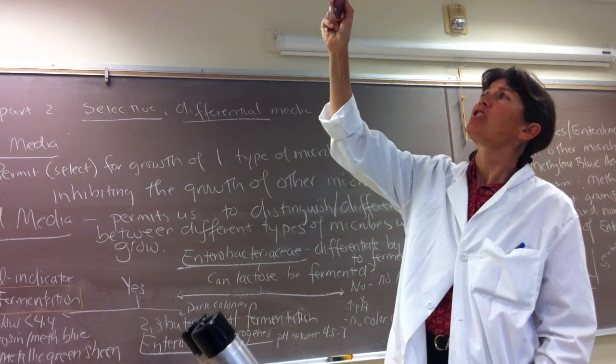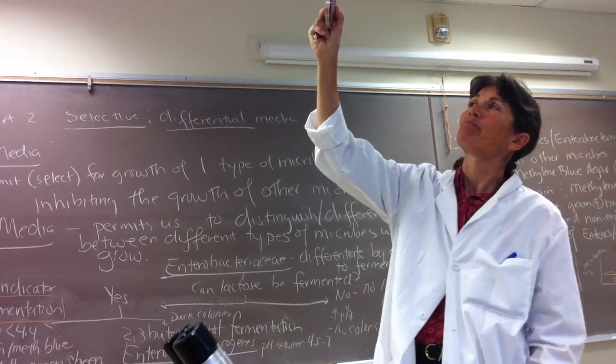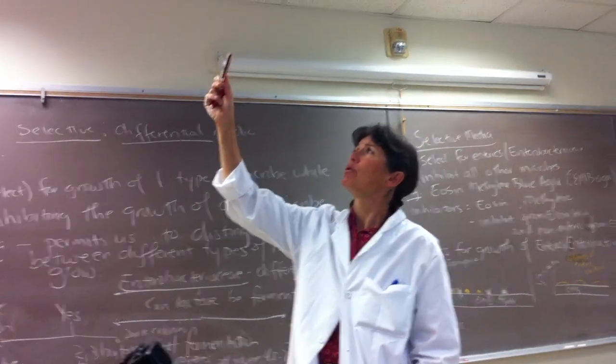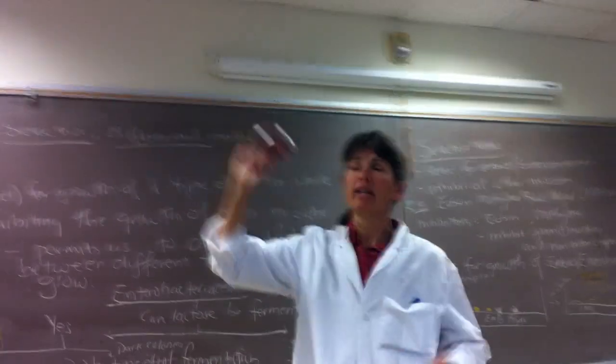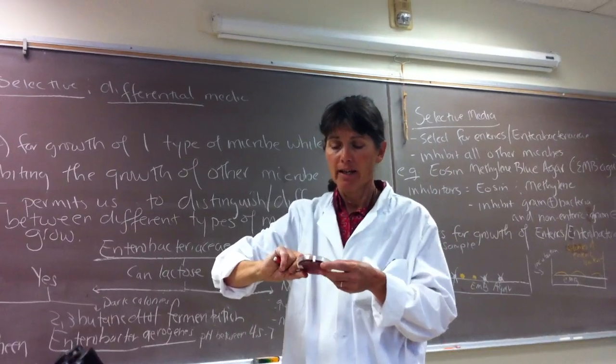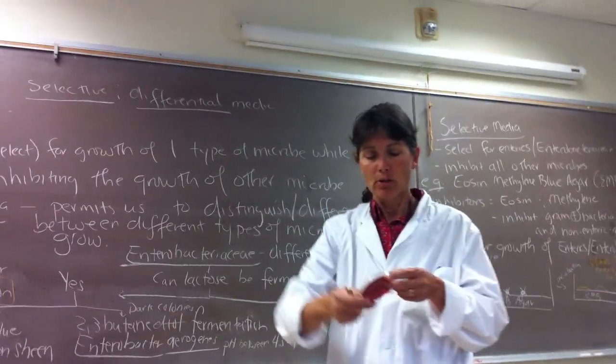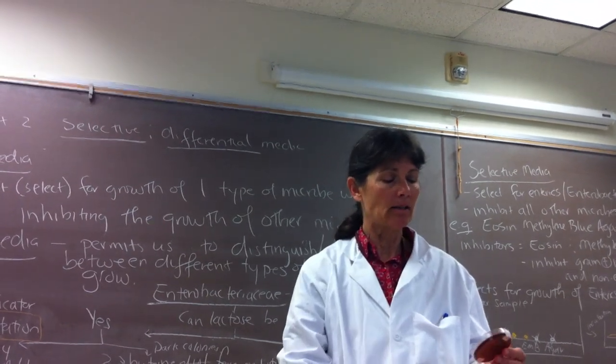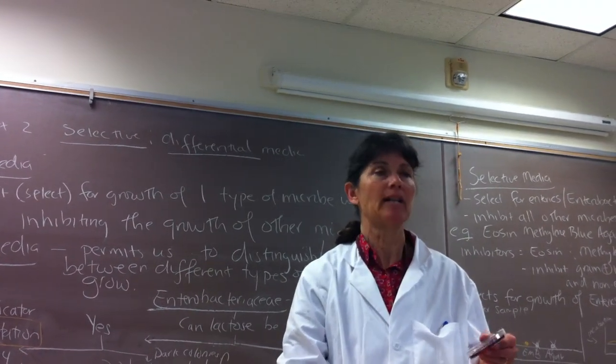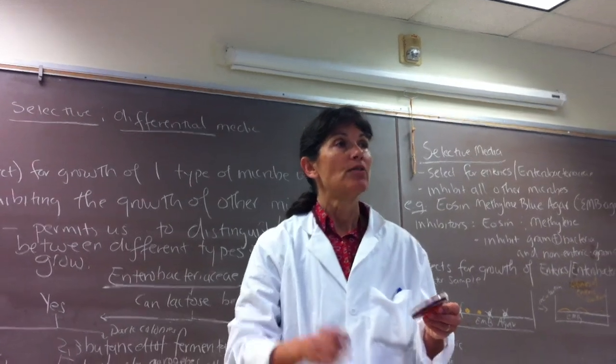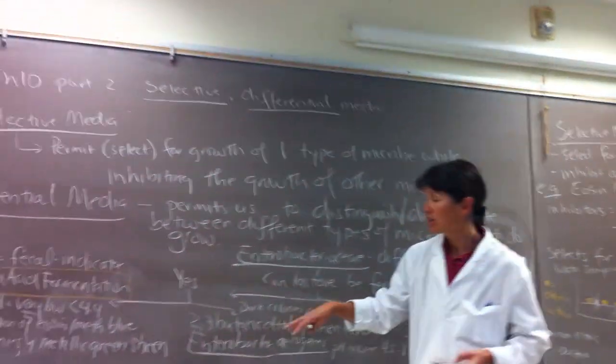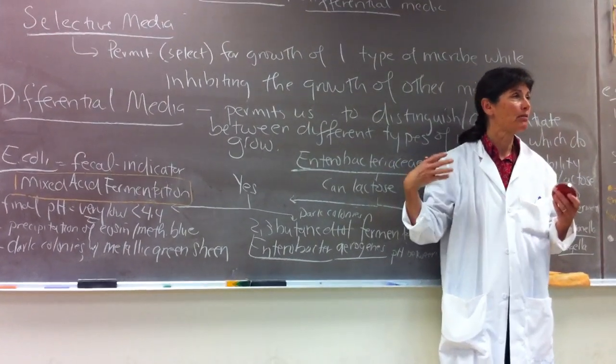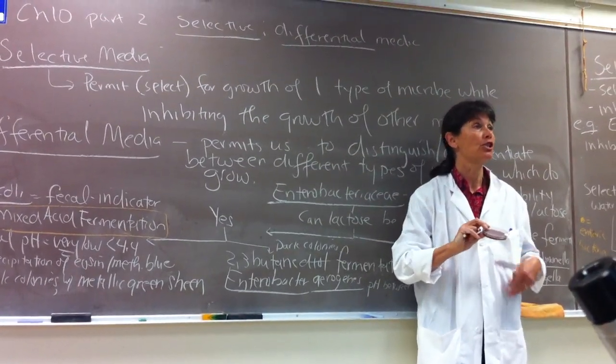And then the Enterobacter aerogenes, which is the portion of the plate labeled as C, if you hold it up to the light, you can see it is dark, right? Not as dark as the E. coli. And if you turn it over, you can see that it's appearing as kind of a dark pink color, but there's no metallic green sheen. So that is precipitation of the eosin-methylene blue, but we don't get such dramatic precipitation that we get that metallic green sheen.